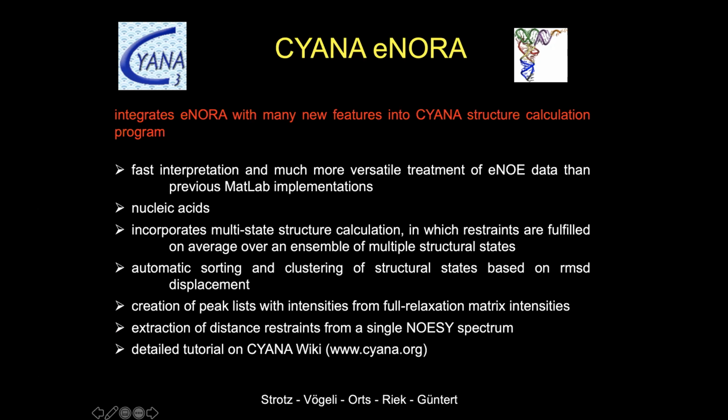Okay, so what does it do? So INORA integrates into CYANA and has also many new features that are really nice. And this new version, this is really a quantum leap. So I expect much more people to use this new version. Why? It is very fast for interpretation and much more versatile in treatment of NOE data than the implementation in MATLAB.